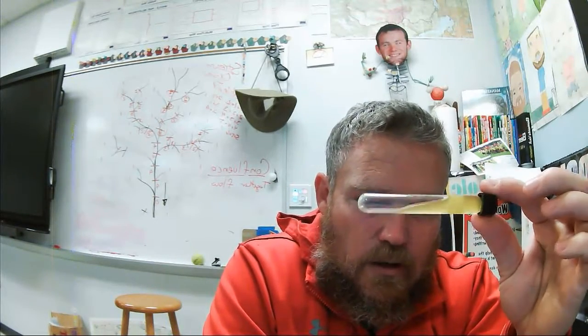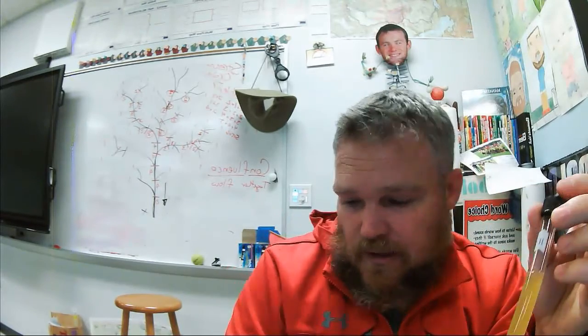And then to give us a control, we know that water outside interacts with animals all the time, and there tends to be fecal coliforms out there. So this one turned yellow. When bacteria are present, just like we do, they have to breathe in and out and give off different chemicals as part of their metabolic process. The chemicals they give off mix with the solution in here, and it'll turn it yellow if they're there.